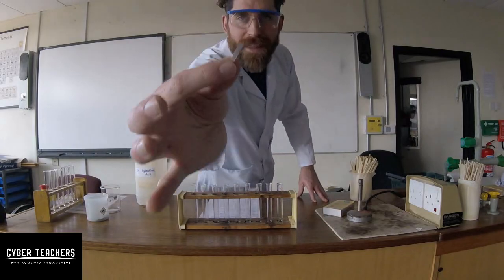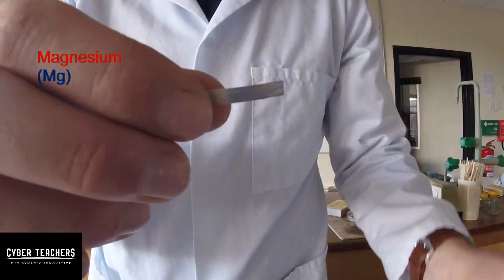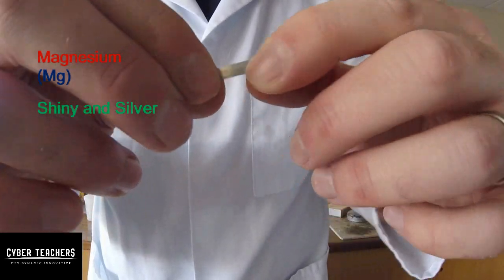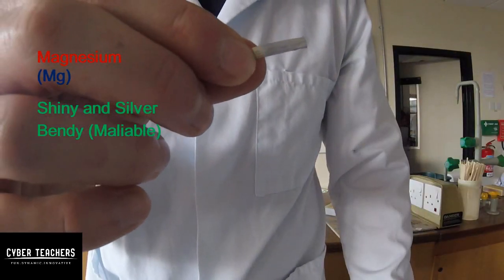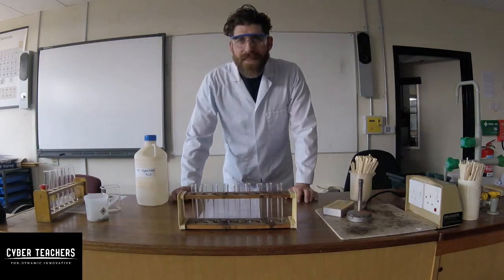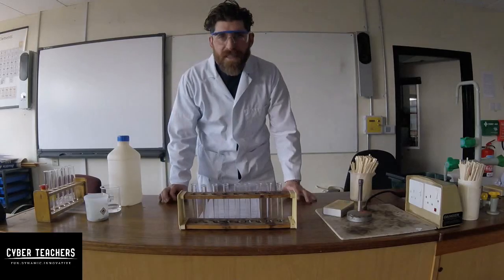The metal we've got is magnesium. It's a typical metal — it's shiny, it's bendy, but it's quite reactive. Magnesium is the second element down in column two of the periodic table.